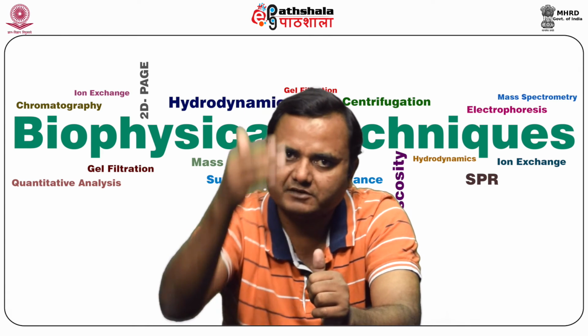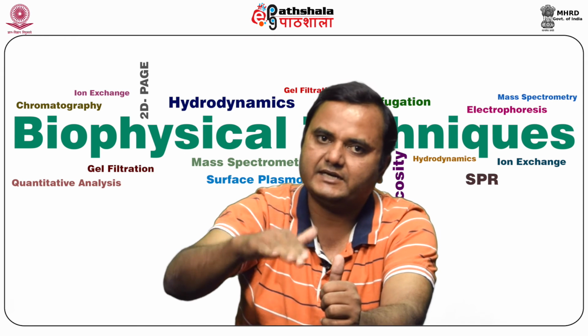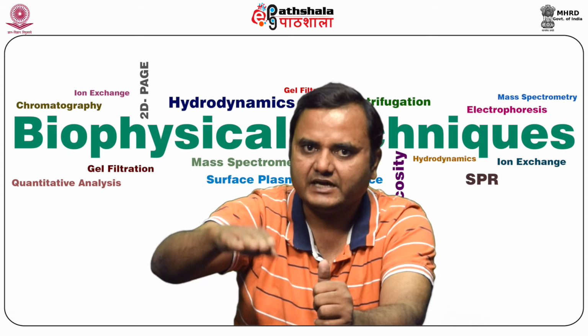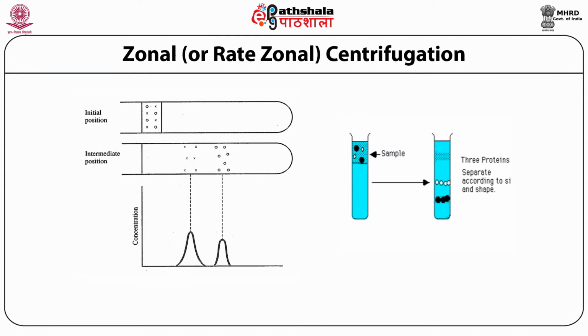So once the molecules start traveling from top to the bottom, they will settle as per their density and their size in the tube. The idea about zonal centrifugation: here you can see in rate zonal centrifugation, the molecules are kept at the top and then centrifuged for a longer time. You can see the three proteins separate according to their size and shape once it achieves the gradient.